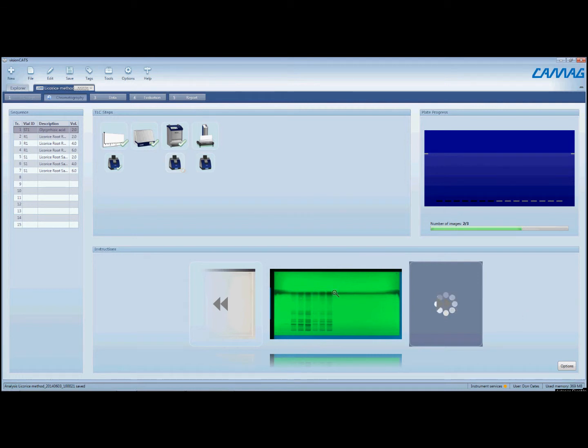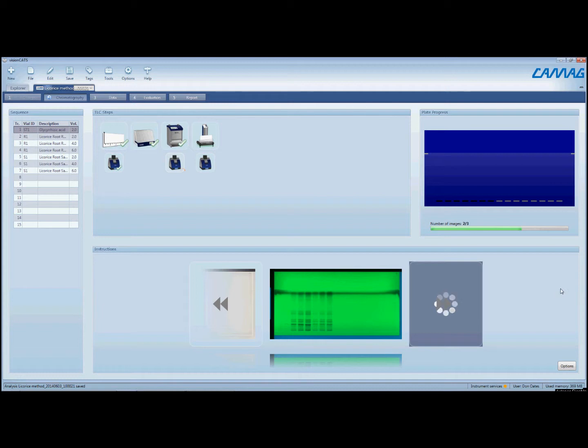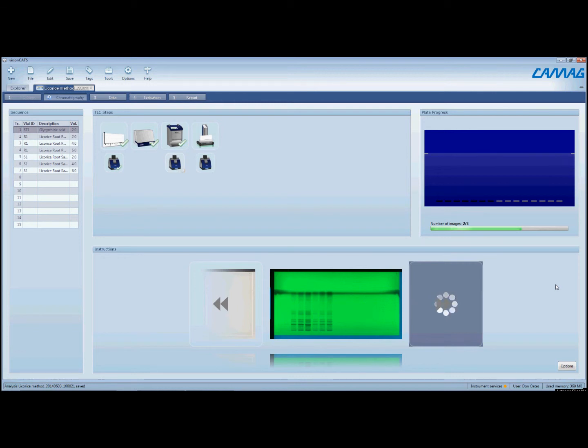You'll notice the dark line on the plate here. That is most likely due to the plate being a little bit dirty when I used it. I probably should have rinsed the plate, pre-washed the plate beforehand, which is something we typically recommend doing, where you would just develop the plate in methanol all the way up to the top of the plate and then dry the plate thoroughly.